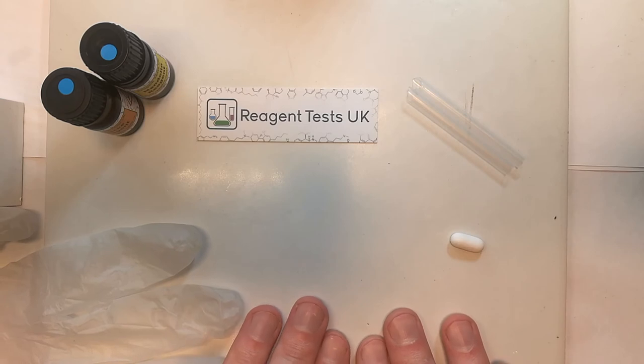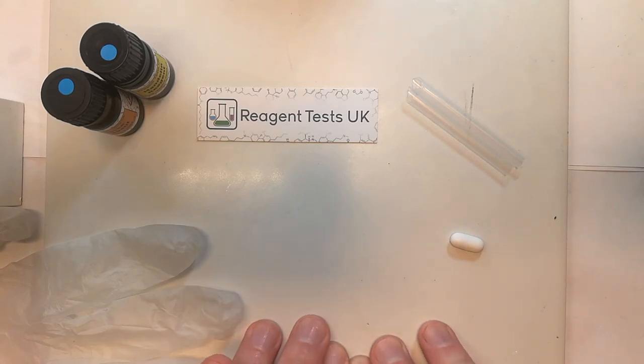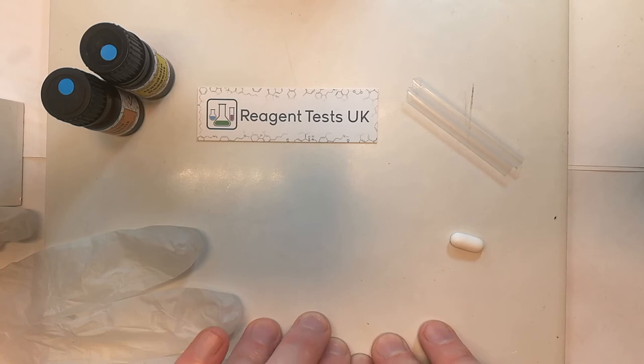The testing surface itself needs to be highly chemical resistant to avoid any colour change. Some plastics are suitable for this, such as HDPE which is what milk cartons are made out of, but the most recommended substance is ceramic. This is highly unreactive and very easy to clean.